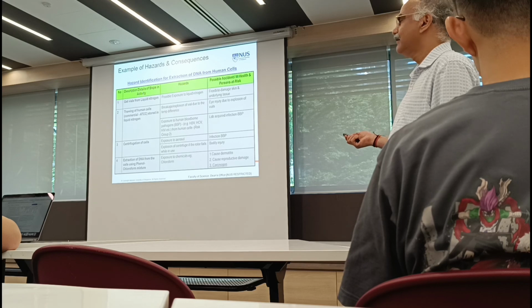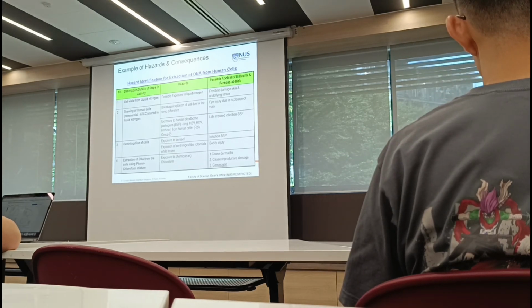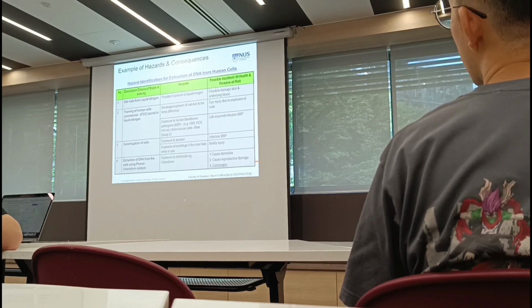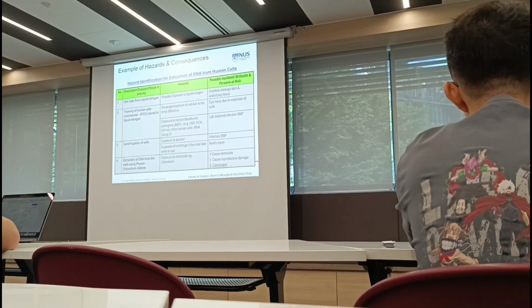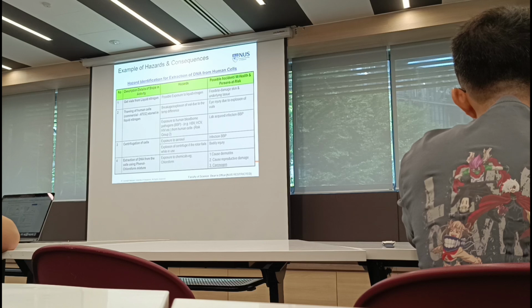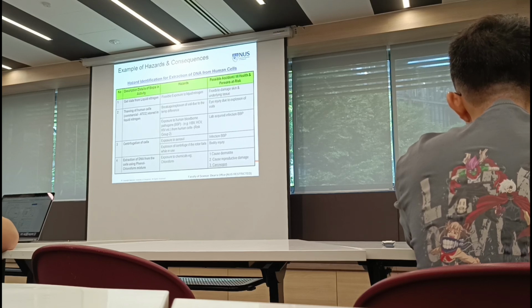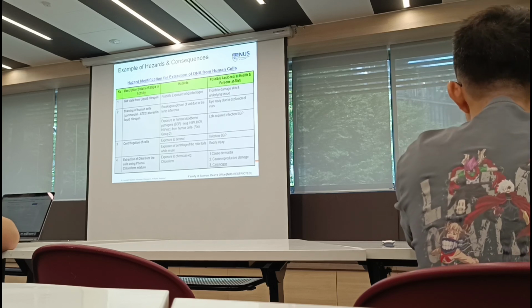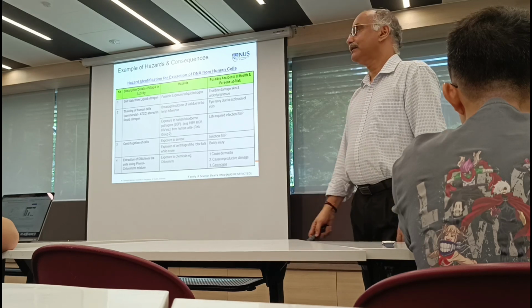Then the other one is DNA extraction from human cells. Again, that's more like a biological experiment, right? Many of you probably don't do it, but again, split it into different steps, and then look at the hazards associated with each step, yeah? And then do the what can go wrong, possible accidents, right? So go through those steps and understand how they are divided, and the more steps you create, the easier it becomes, yeah? Instead of a one step process, right? So that for each step you can identify what the hazards involved are.